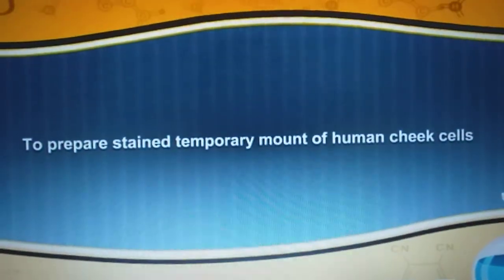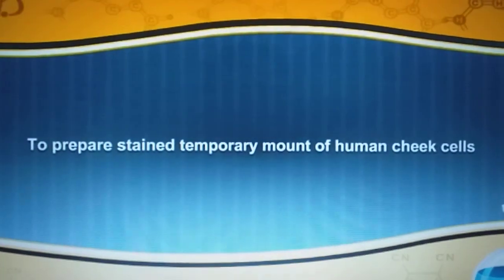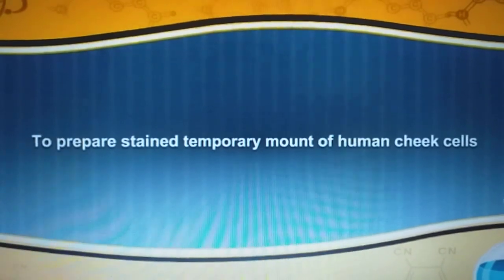Good morning, today we will study about the next practical that is the preparation of temporary mount of human cheek cell.